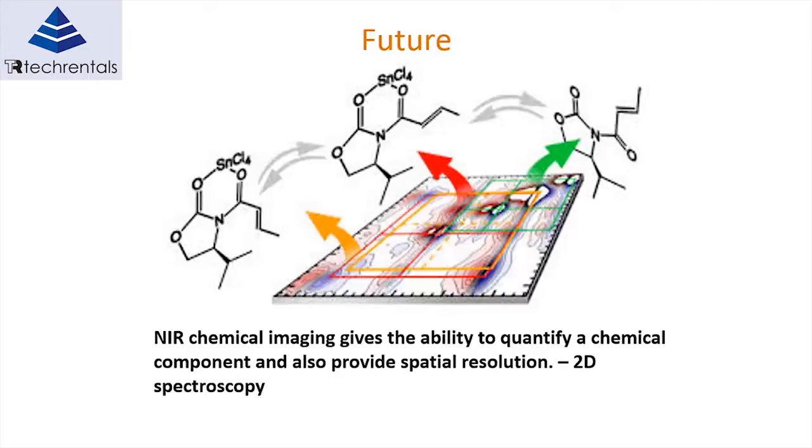With near-infrared spectroscopy, we collect light through our sample. We're not necessarily looking at the complete surface of the sample or the complete volume of the product, where the light is diffracted through the material and then measured by our detector. But it's not representative of a visual image.